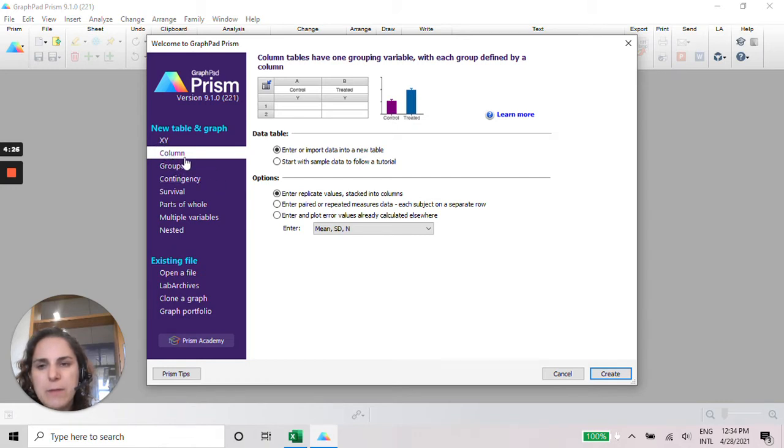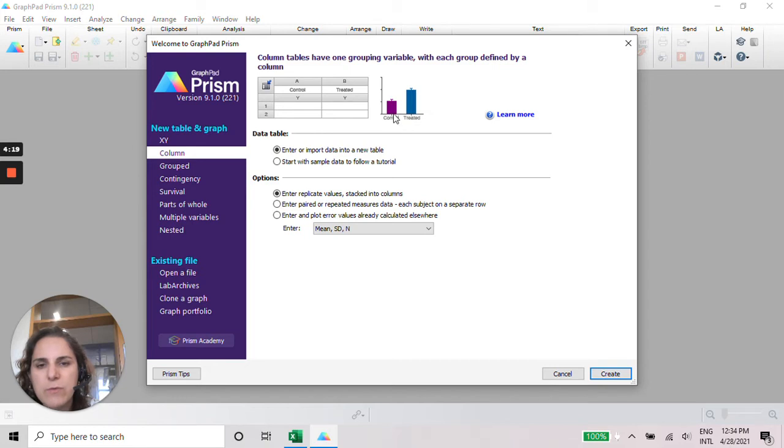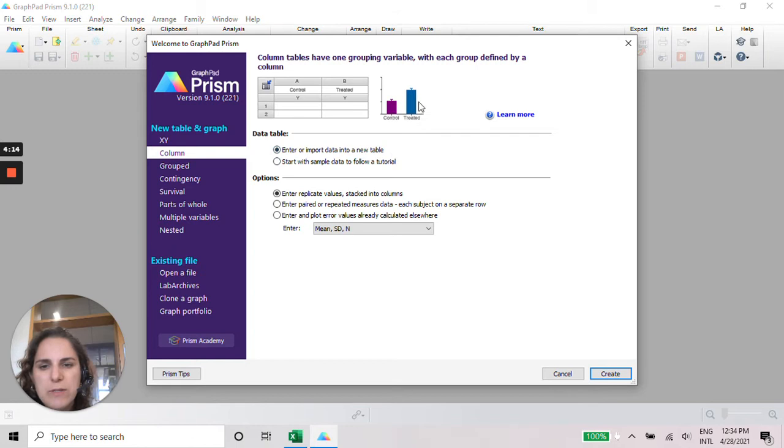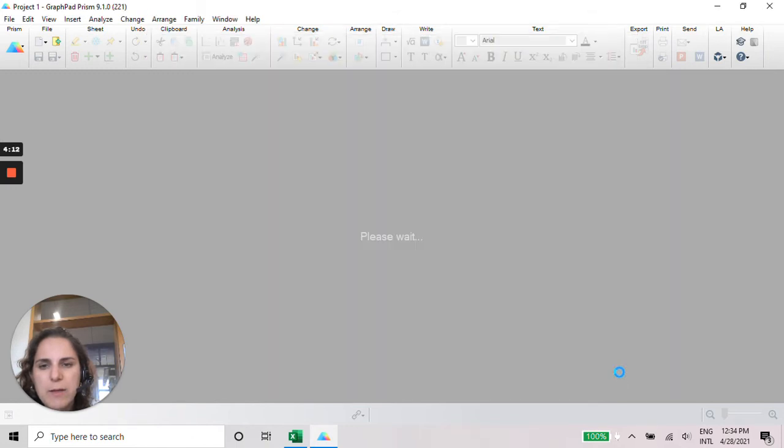In our case now, for the data that we have, we are going to make a column graph that looks like this, because we have the wild type animals and transgenic animals. So this is what we need. Click on Create.